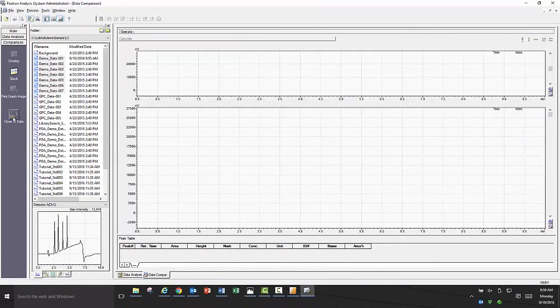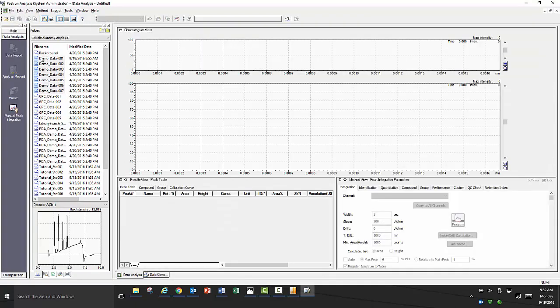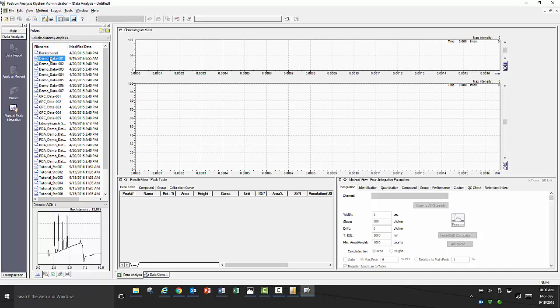To look at an individual data file in more detail, go back to the main assistant bar menu and select data analysis. Once that is opened, just as in data comparison, you will see the file explorer window. Select your data file you want to look at either by double clicking on it or by dragging it into the chromatogram view.